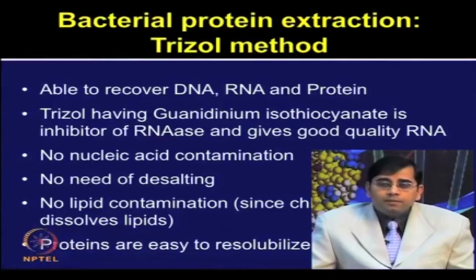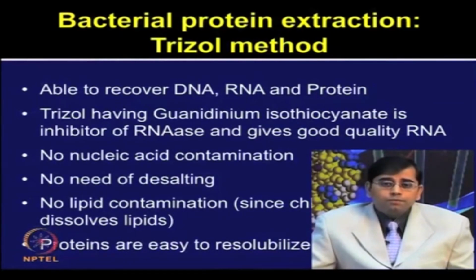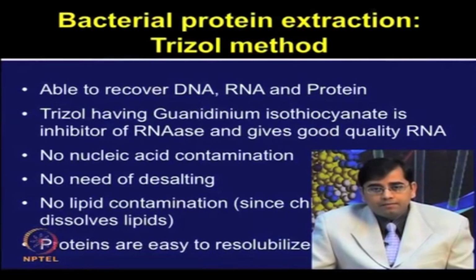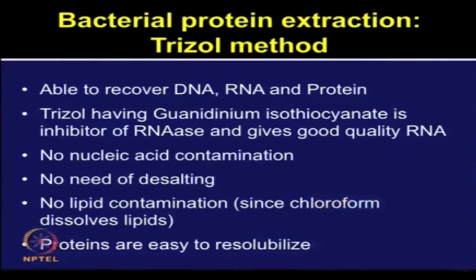There is no lipid contamination, because chloroform is used along with Trizol, which dissolves the lipids. So, this method is able to get rid of various types of interfering components as well as different types of contaminants. And finally, the proteins are easy to resolubilize after extraction with the Trizol based method.